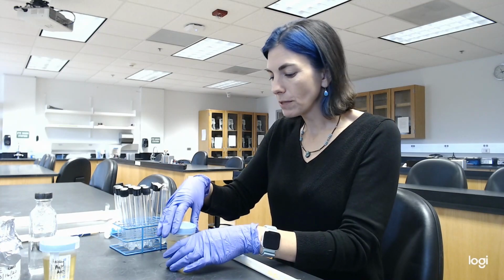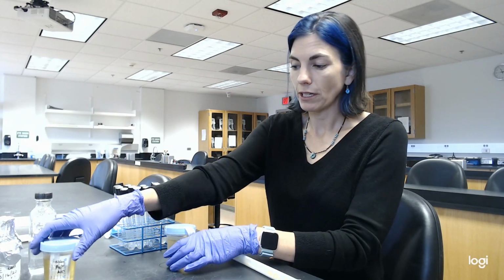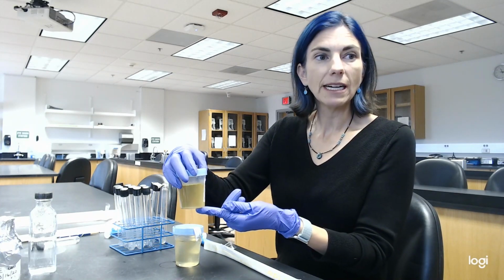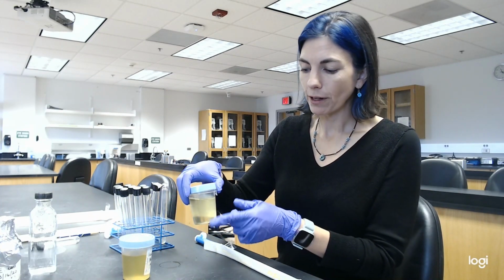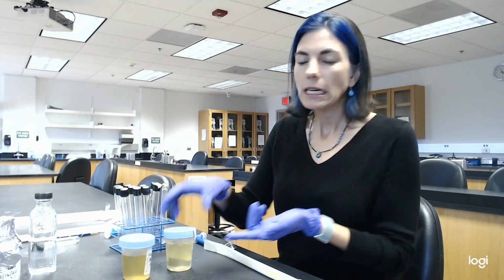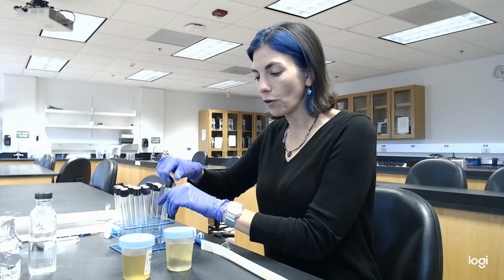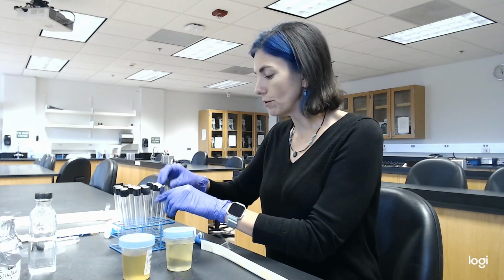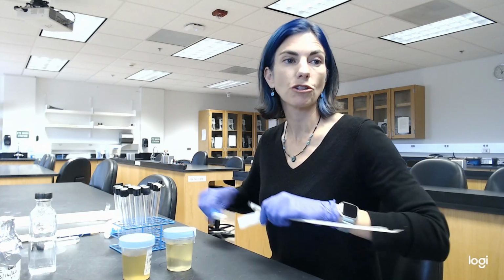So there are some slight differences in the color of these urine samples. The pre-urine sample is a little more dehydrated, and the post-urine sample is a little more dilute. So that may affect the results, and unfortunately it's a type of introduced bias that I don't know how to correct for given the constraints.